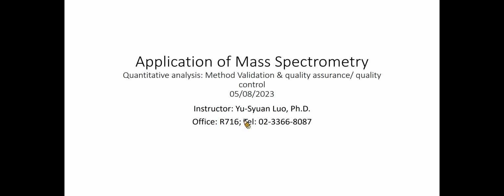Before conducting the quantitative analysis, we need to make sure that the analytical method is robust and reliable. Today, I will navigate you through the processes of LC method validation. In this lecture, you will learn how to optimize the ionization and mass parameters during method development and the basics about LC mass quality assurance and quality control.